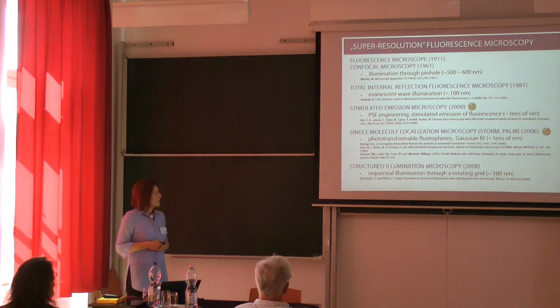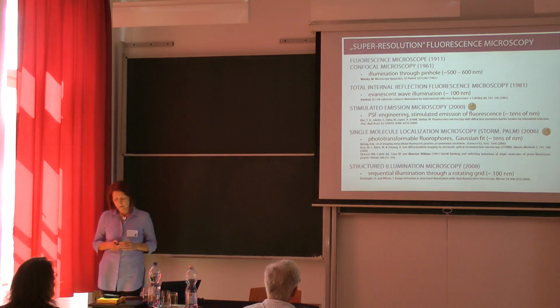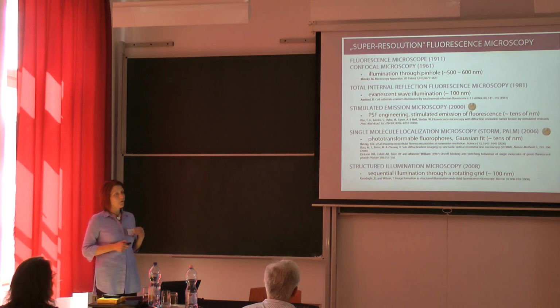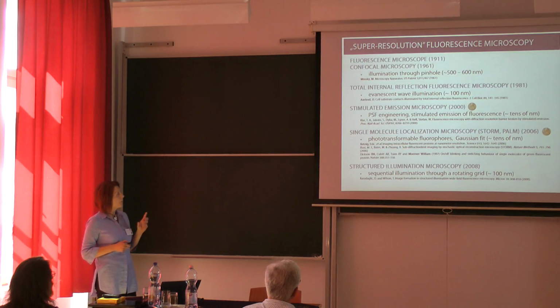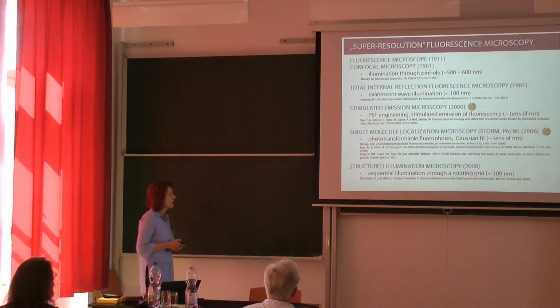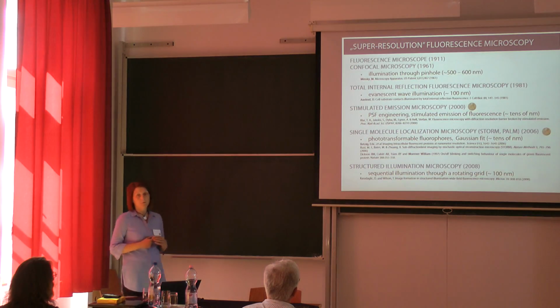And the last one is the structured illumination microscopy from 2008, and here the idea is to image the sample through a rotating grid, and then comparing the different images and the position of the grid, and doing some mathematics, we can get a two-fold improvement in the resolution.